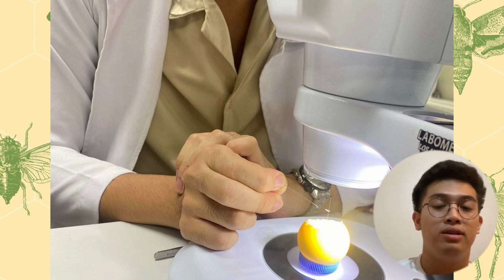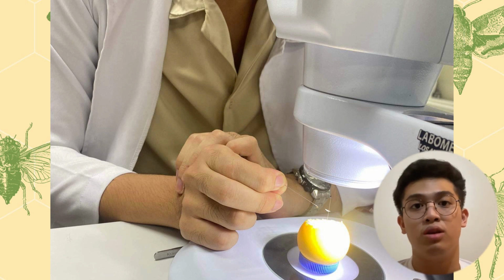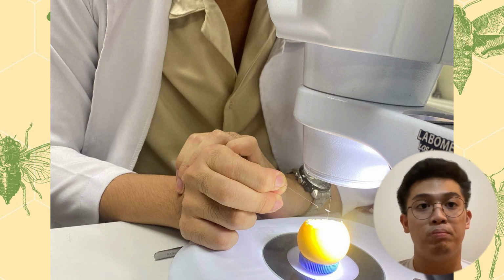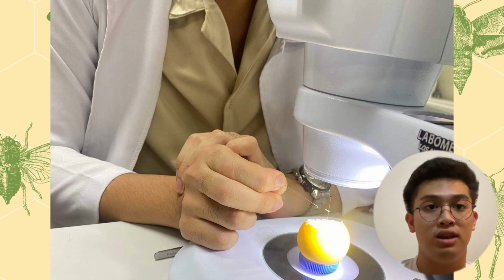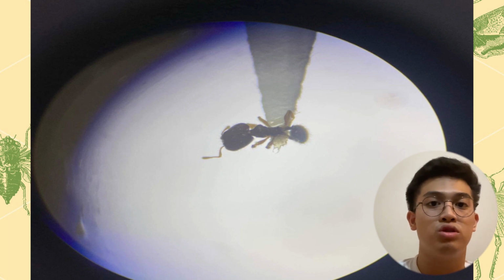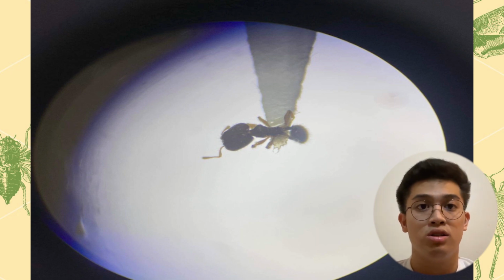Let me further elaborate. Entomological mounting refers to the preparation of an arrangement where pinned insect specimen papers are placed. This step serves to keep specimens in place and provide for identification and archiving. The materials we used for this are the following: entomological puncher, which is used to make the paper stage, sturdy paper, entomological pins, forceps, glue, as well as ruler and pencil.